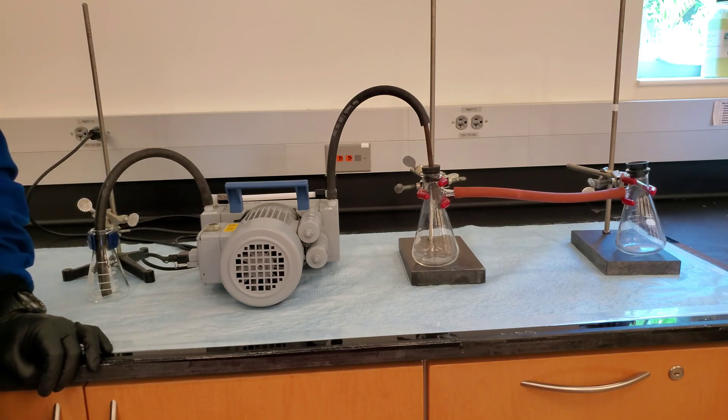Turn on the vacuum pump and test it by putting your hand over the top of the open filter flask.